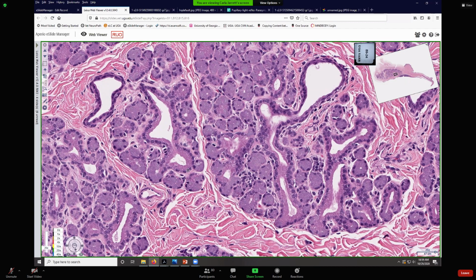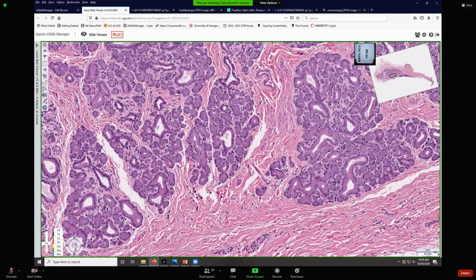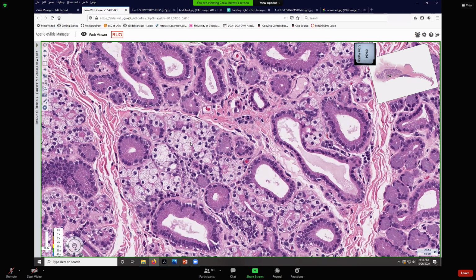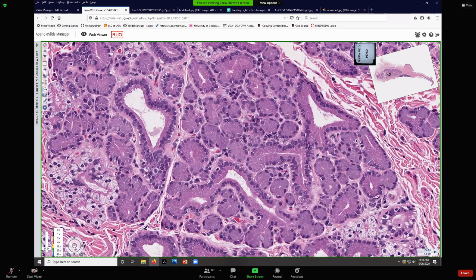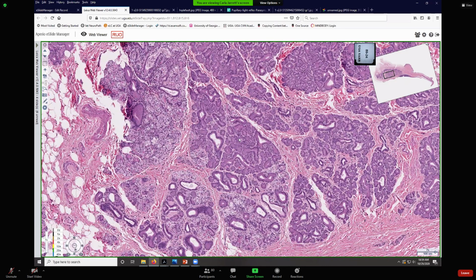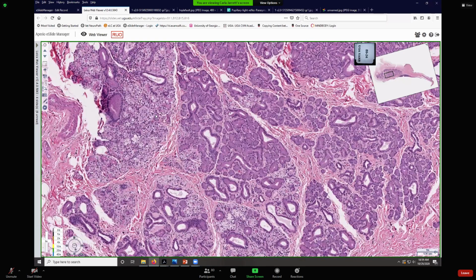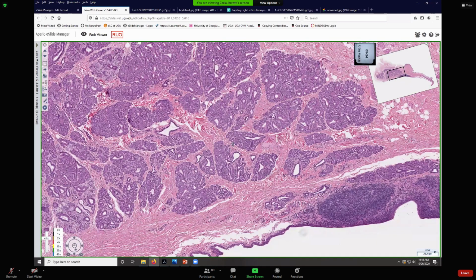Okay, now what does it secrete? It's both a serous and a mucus product. And this one's pretty easy because here you can see the mucin granules. And then here you can see the serous portion. So a watery mucus, seromucus secretion. So compound branching, tubulo-alveolar, some of it's even tubulo-acinar, and seromucus secretion. Okay. So that is the superficial gland of the third eyelid.